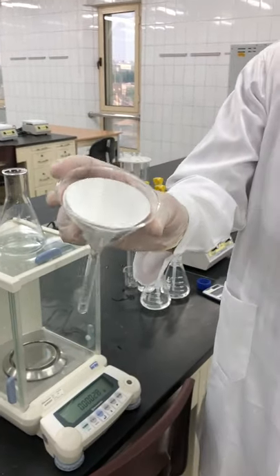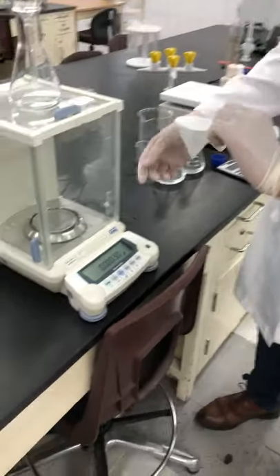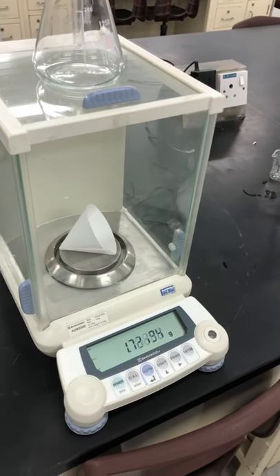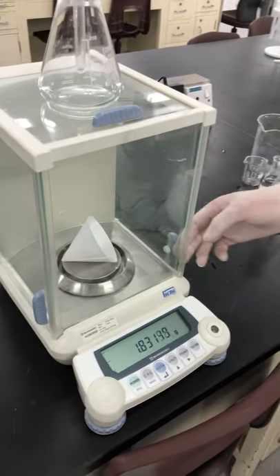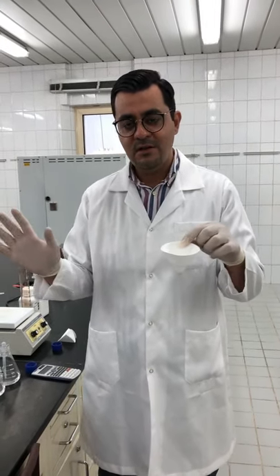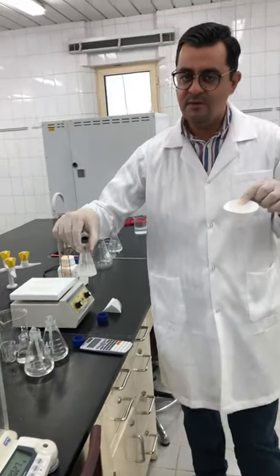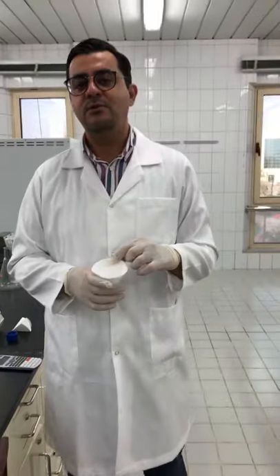We dried the filtration system, and here is the white precipitate of barium phosphate. Now we take it and record the reading of the balance. Subtract this mass from the mass of the empty filter paper to get the mass of barium phosphate, and keep it recorded in your lab manual. Everything is done and ready for our calculations during the lab session — we have the mass and we've identified which is the limiting reactant and which is the excess. Thank you.